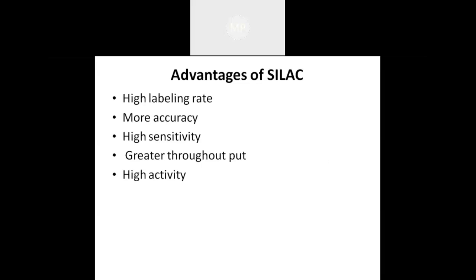The next is the advantages of SILAC. Basically, SILAC is a simple and powerful method for quantitative analysis of proteins, characterized by quantitative accuracy and high reproducibility.